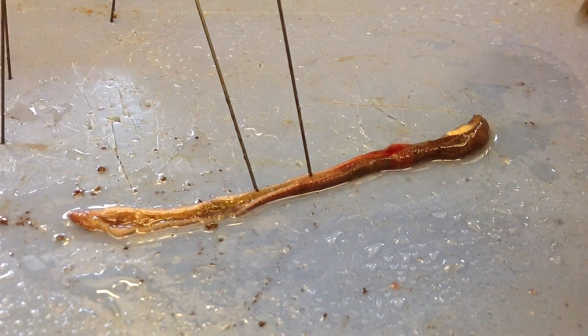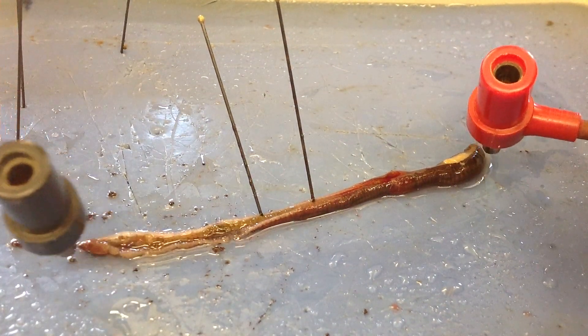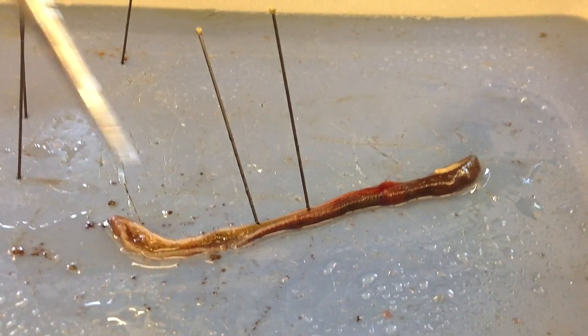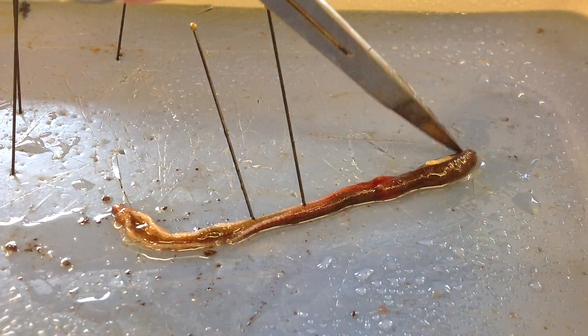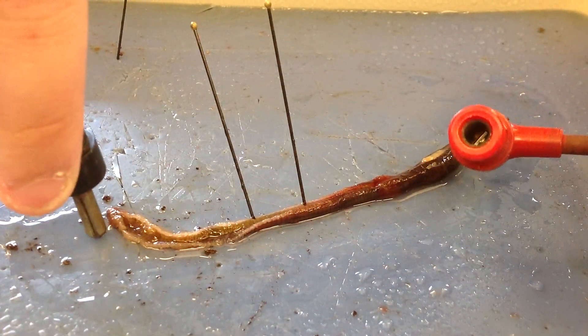Now the worm is... This is at 3 volts. Try to put it on the axon. I just want to show you the worm is not very active right now. The worm is kind of like, eh, I don't really want to move. So we're going to... And 3 volts didn't really do anything.